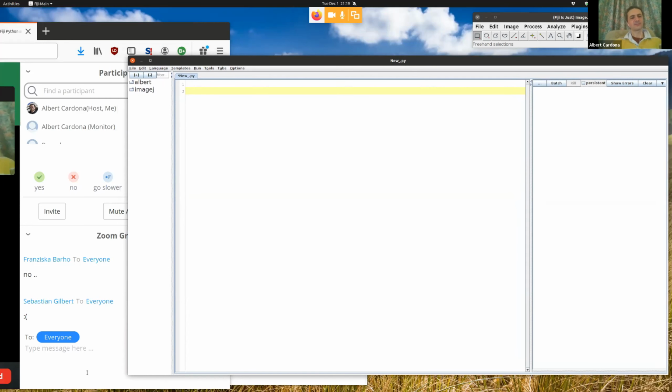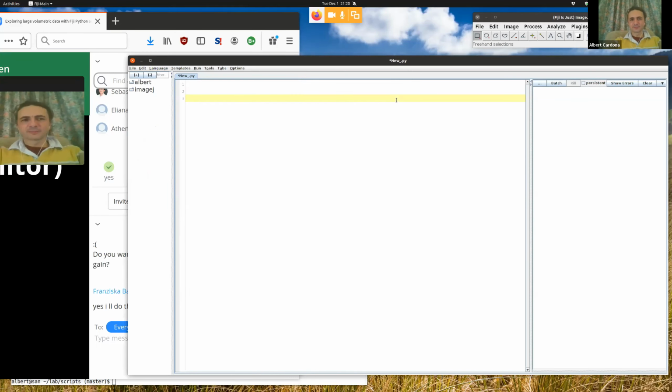Oh, wait, Francisco cannot hear. Go on. So what do I mean by the listener pattern?